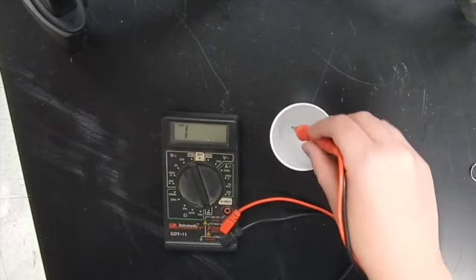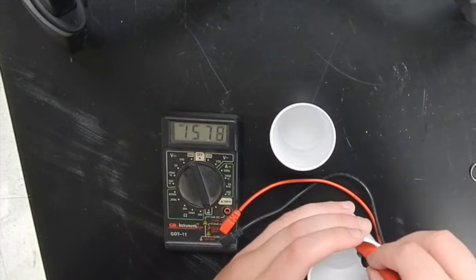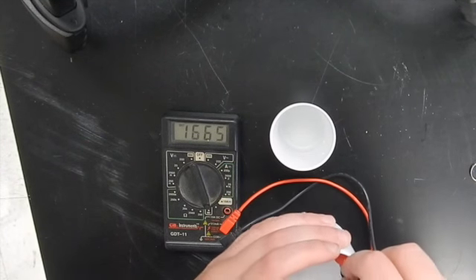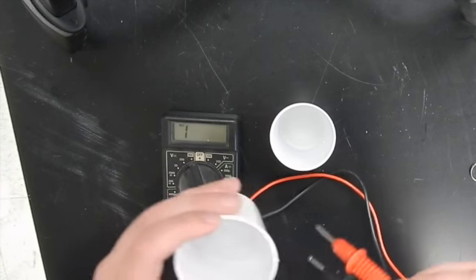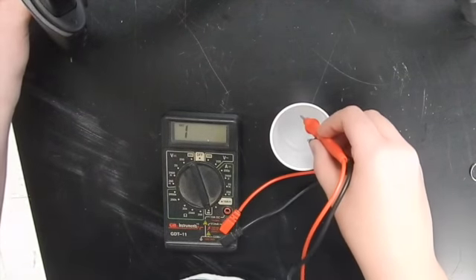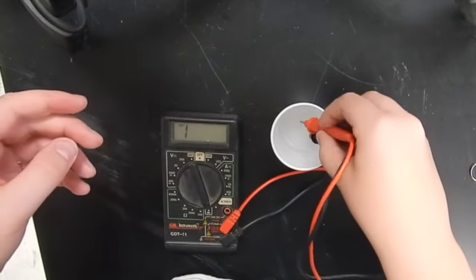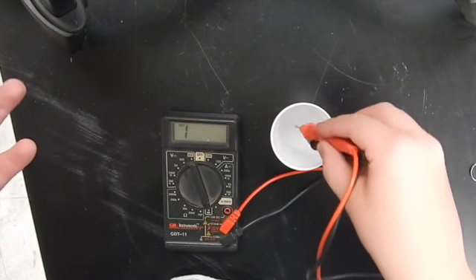So the salt water, if we go back to that, we notice that it jumps up to the 1500s or 1600s. So it is conducting electricity. So in your chart, you could put that salt does conduct electricity very well, whereas the sugar did not. It's not showing up anything.